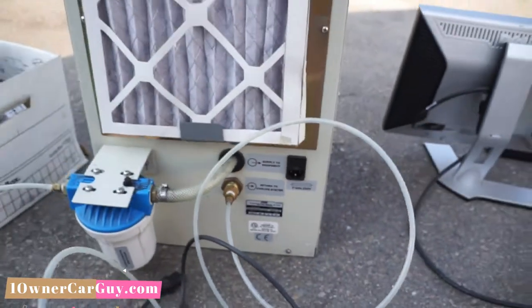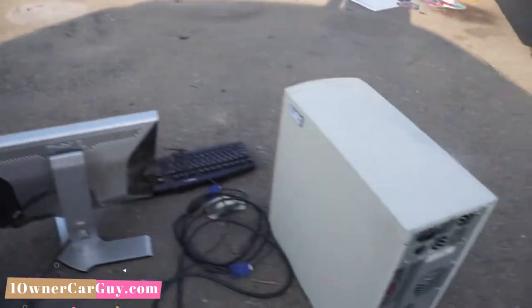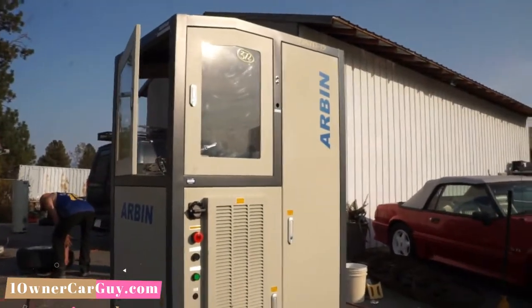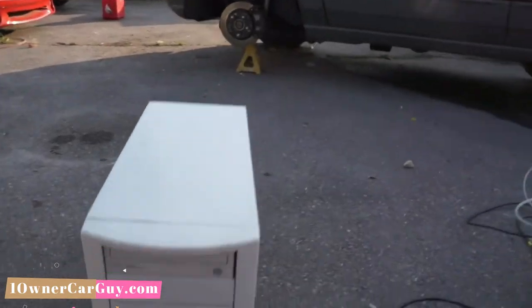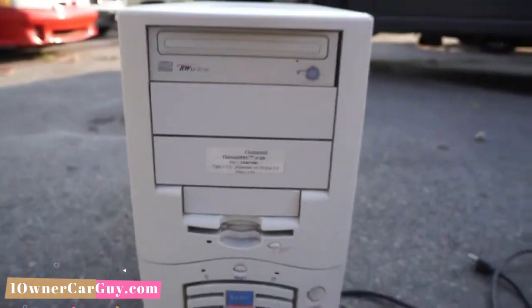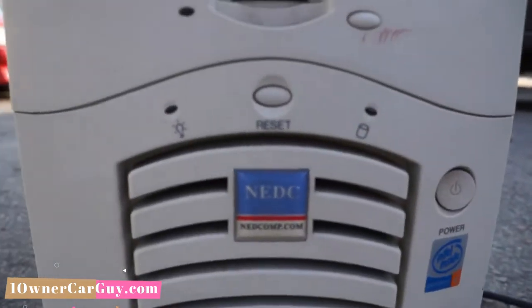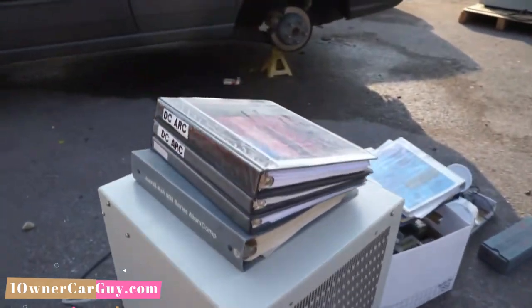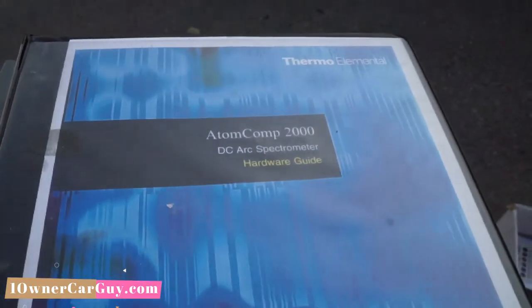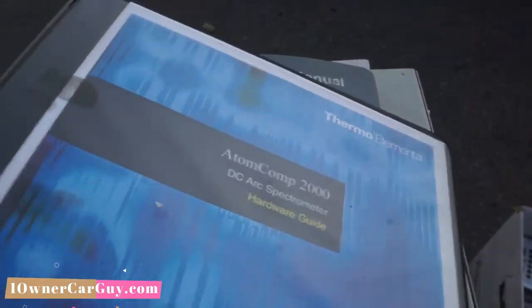There could be the model number and such here. That is pretty much what I know. Here's the computer — I'll be putting a video up also of this one. This one's a unique machine. There you go. I haven't seen a computer like that in a long time. That's the deal. It's just an amazing amount of stuff.